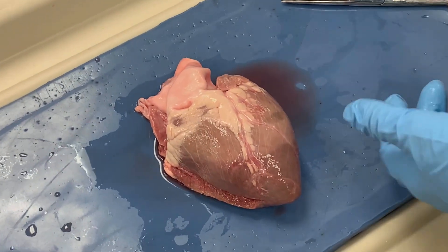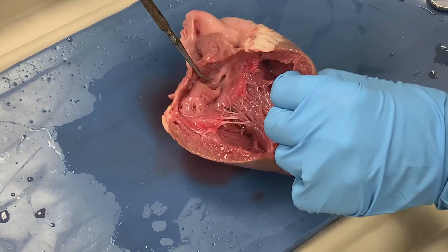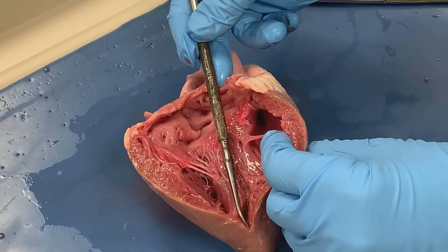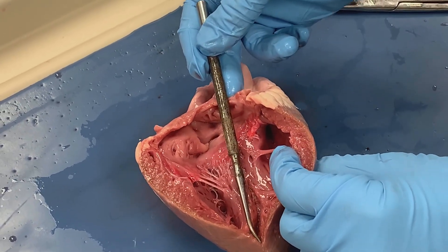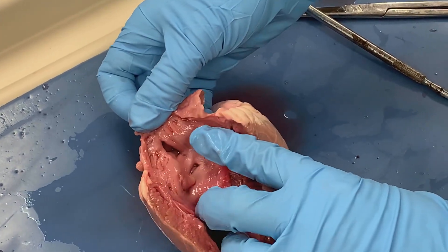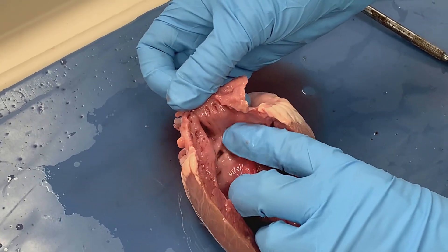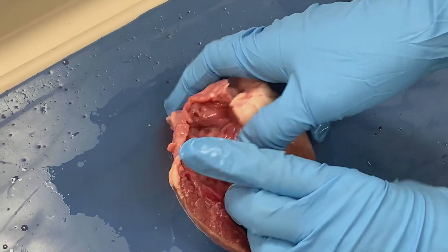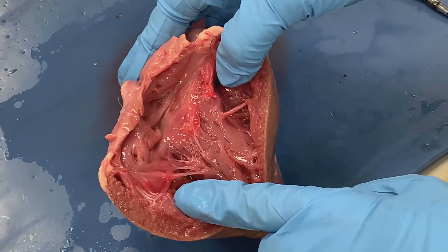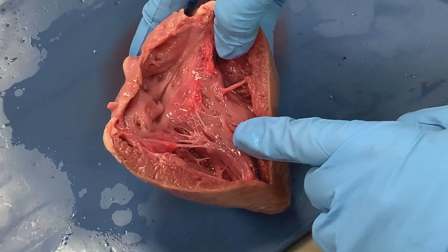We have made our first cut on the heart, extending from the right atrium down towards the apex of the right ventricle. We can now see the inner surface of our right atrium and the pectinate muscle within it. We can also see the inner surface of our right ventricle with all of the papillary muscles.